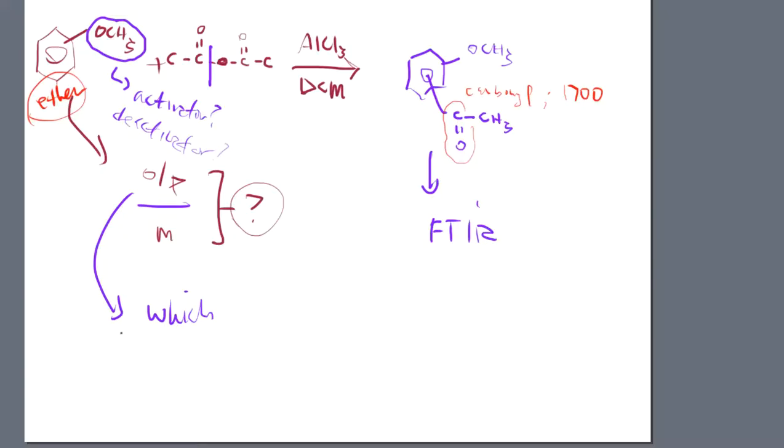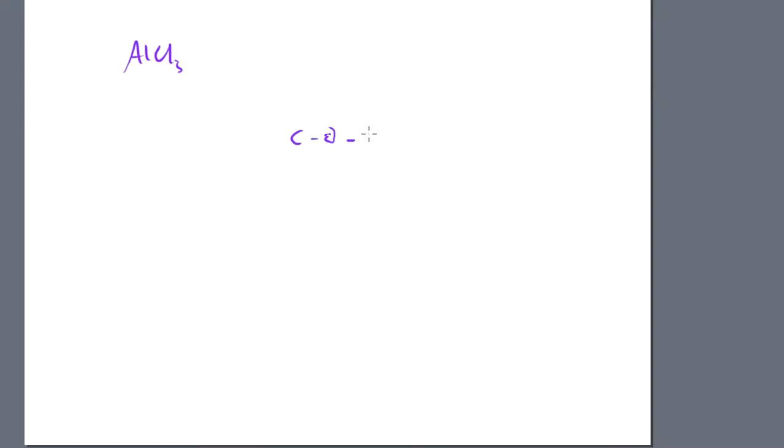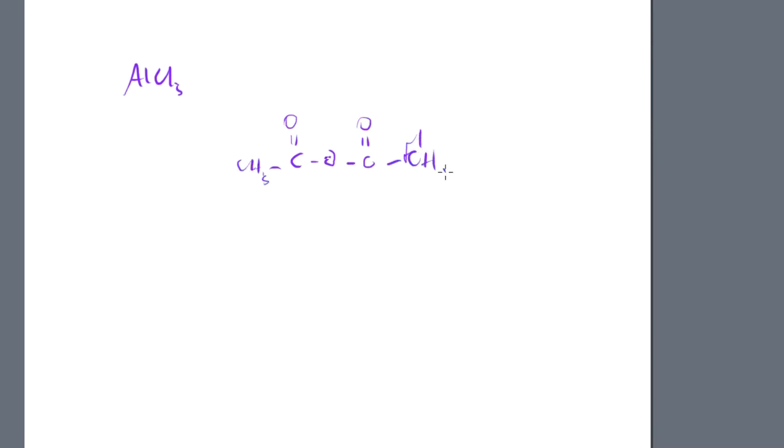All right, so again, I want you to understand that the aluminum chloride is in way excess, and we just do this to ensure that a reaction is going to take place with that catalyst. And you're probably also questioning, well, you said that we were using this anhydride, acetic anhydride. So this is nothing like what we talked about in lecture. Most of the time when we looked at acylation, we were looking at this kind of carbonyl and then maybe here and then maybe a chloro group that's there. And then we added AlCl3. Why aren't we doing it here?